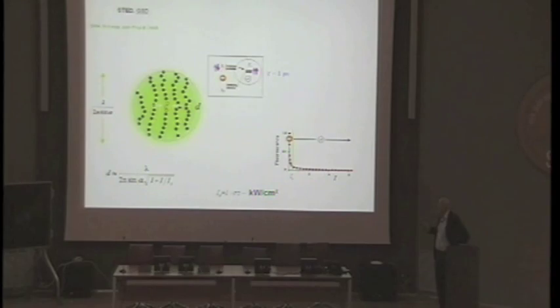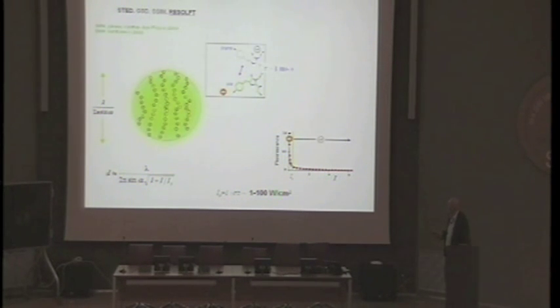Okay. I didn't start out with this because I was scared of photobleaching. If you go to triplet states, I don't want to bother you with that. But another option is to do a cis-trans isomerization. Some molecules can flip an atom or so, and they can go from cis to trans, and trans is dark and cis is bright, and the lifetime of the state is relatively long. So milliseconds to seconds in this case means you further reduce the intensity, and then you shut them off. And then you get the molecules here off, and here you get them on. And so these differences in states allow you to tell them apart at much, much, much lower light levels.